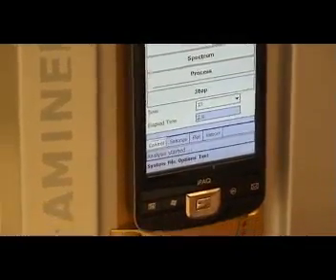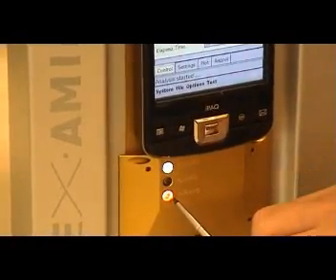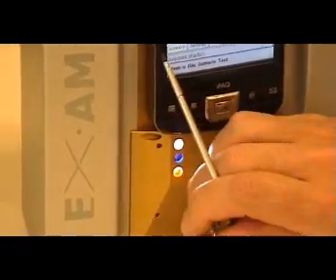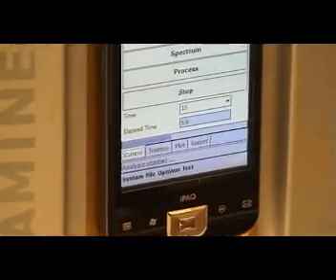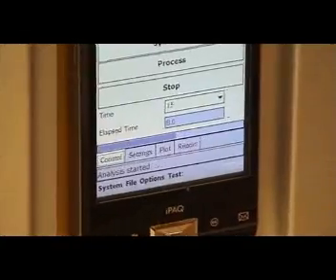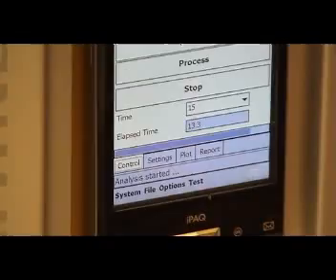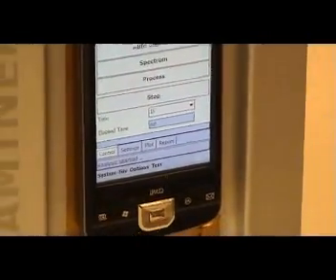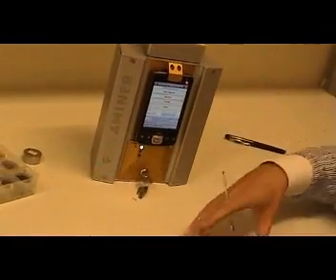The tube is not on yet, but now you heard the click and the tube will go on when this light is orange. So the tube is on now. Since we have selected 15 seconds, the instrument will measure for 15 seconds. After the 15 seconds, the PDA will take over the calculation. When we would use a PC next to it with a USB connection, the calculation would go faster. But now we choose to show you the instrument as you would use it in the field, or maybe even in your lab.